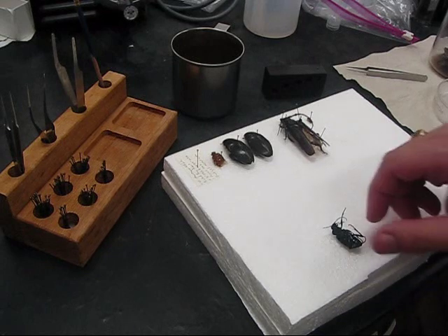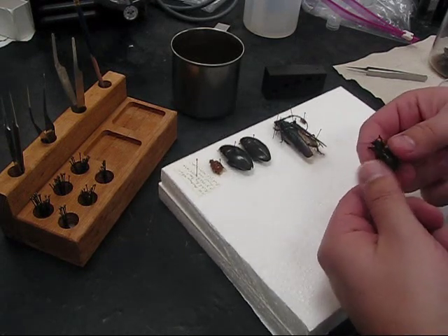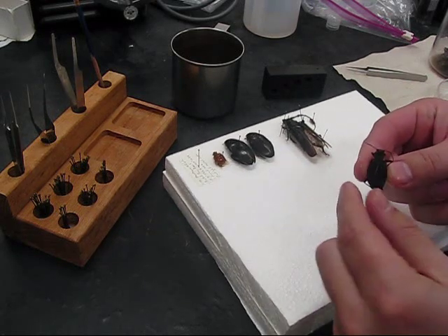How to Pin an Insect. Here I have a ground beetle. I'm going to fold its legs under so they take up less room and they're less likely to get broken once the specimen is dried out.